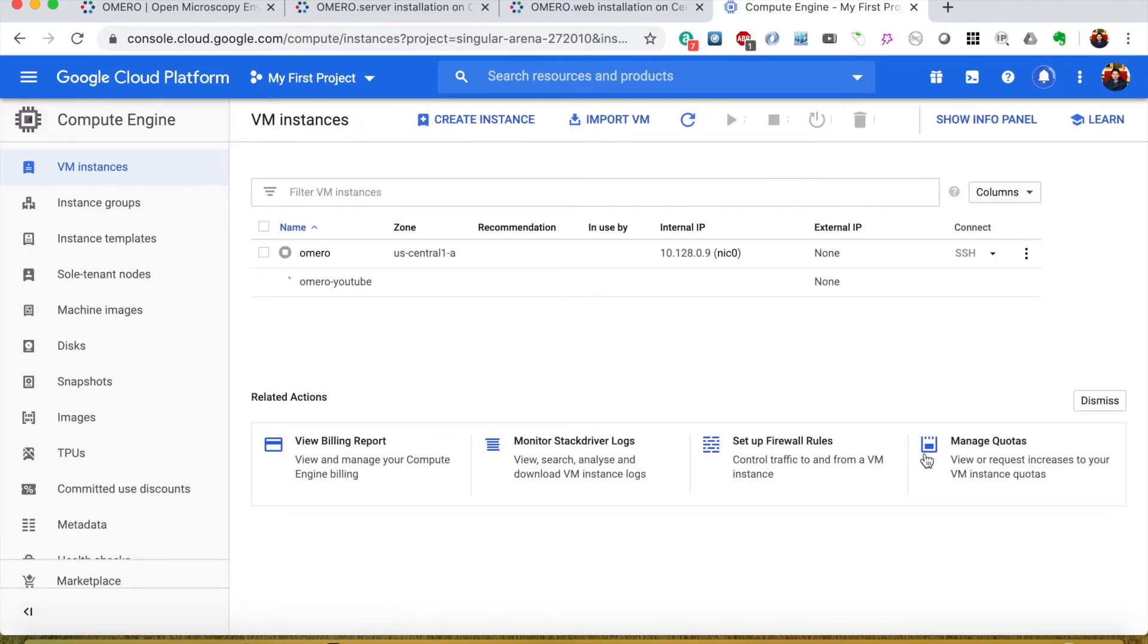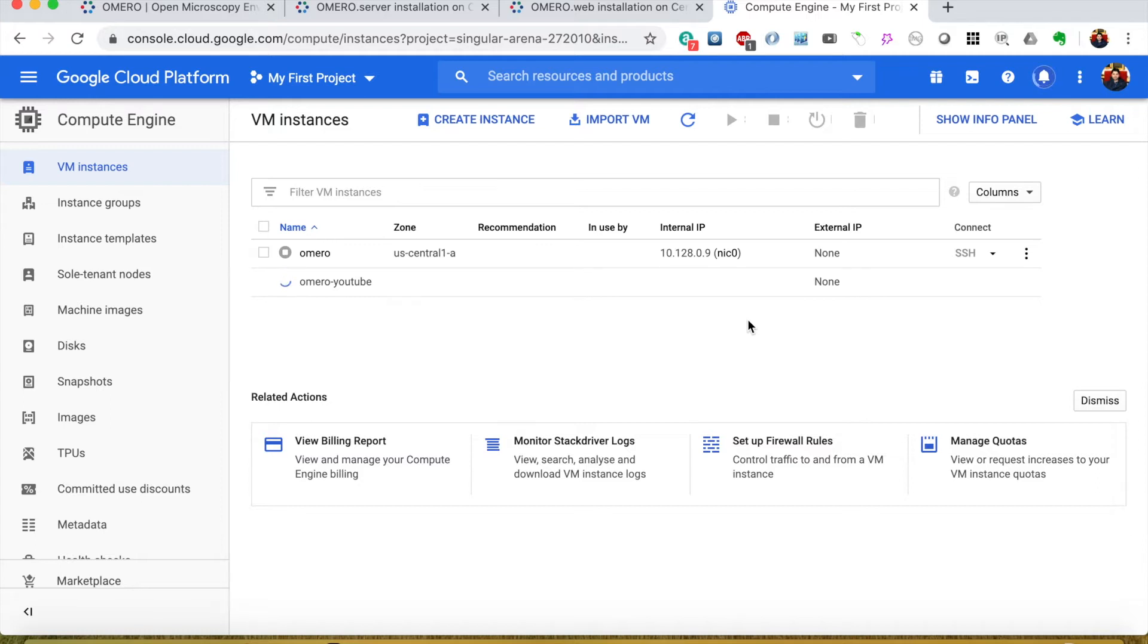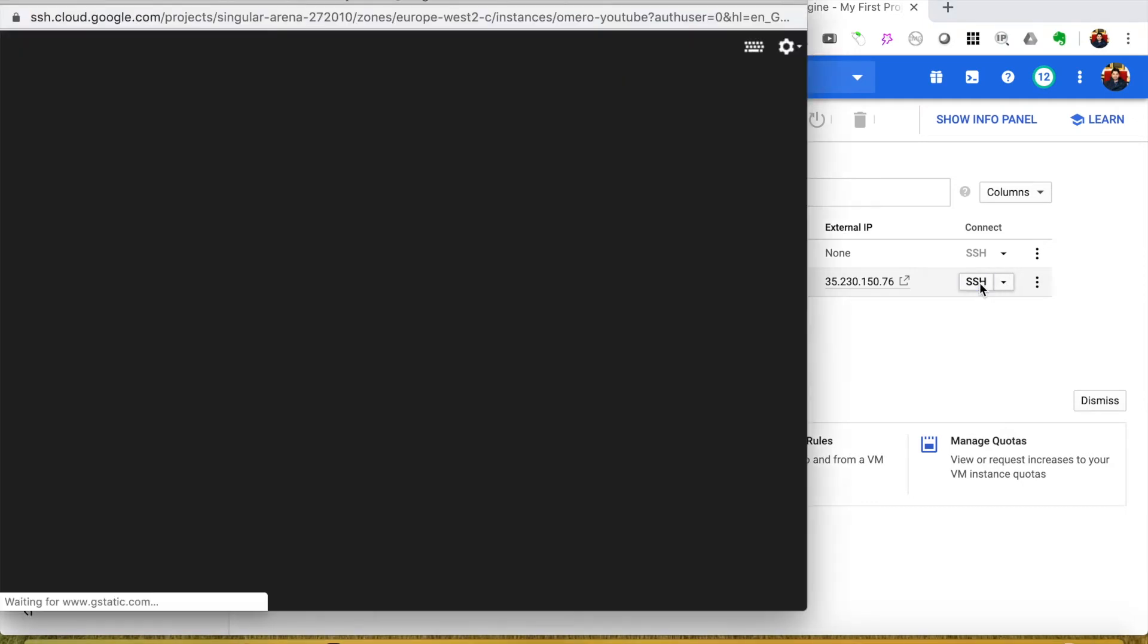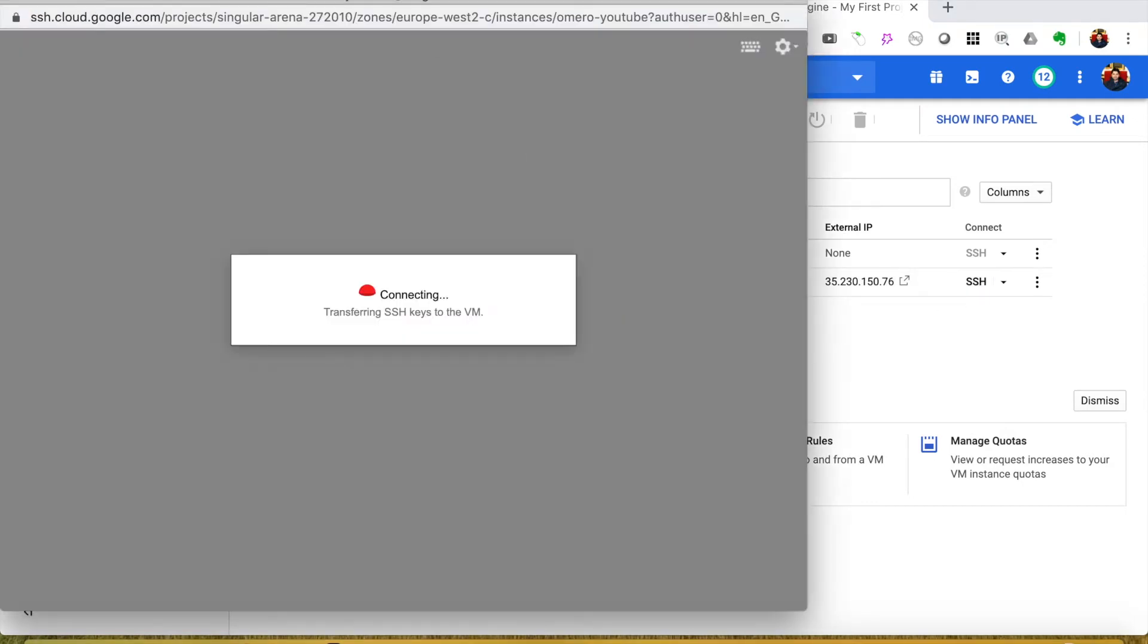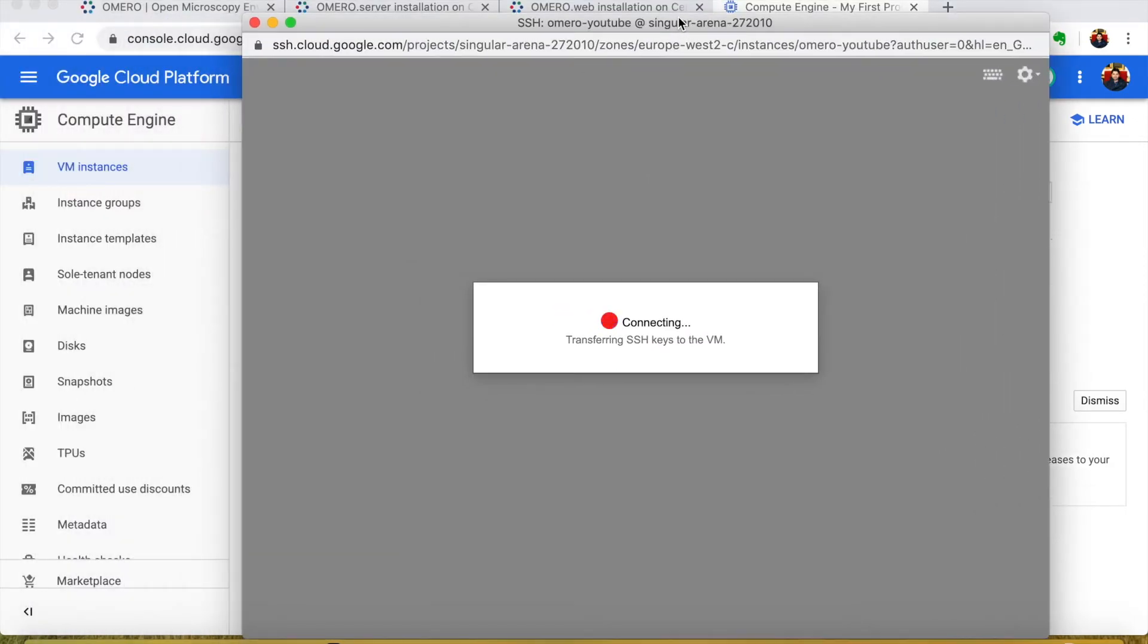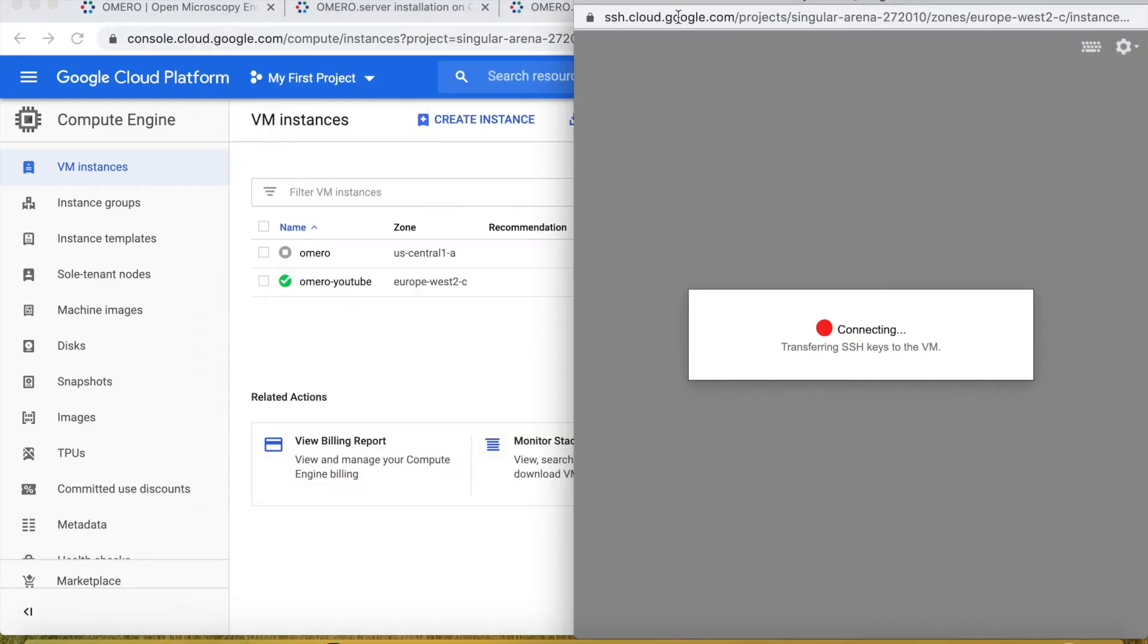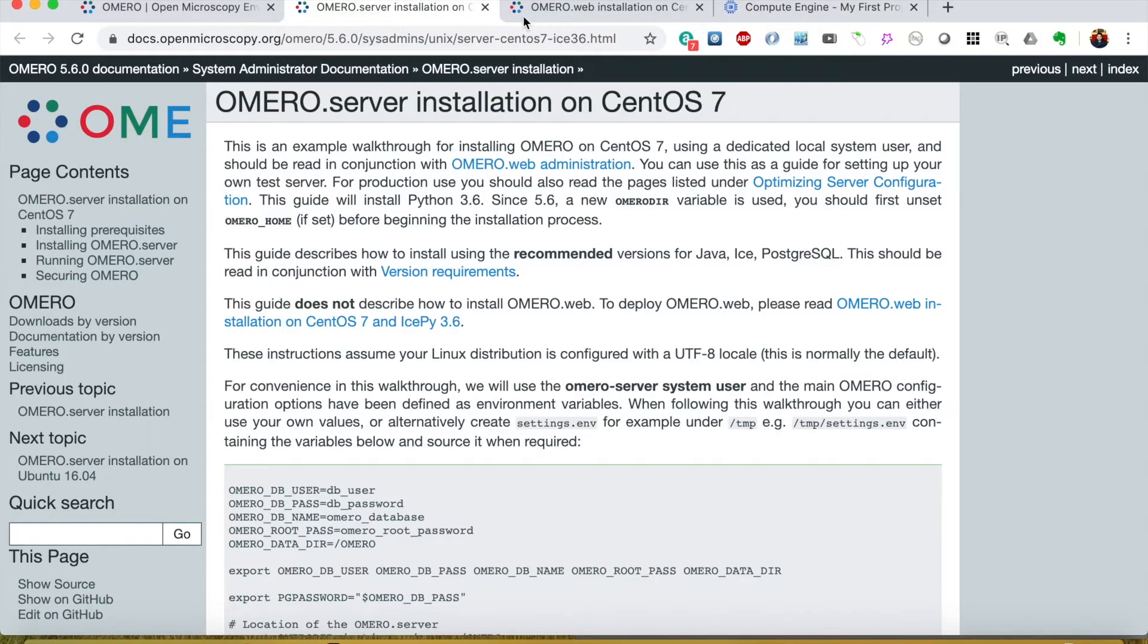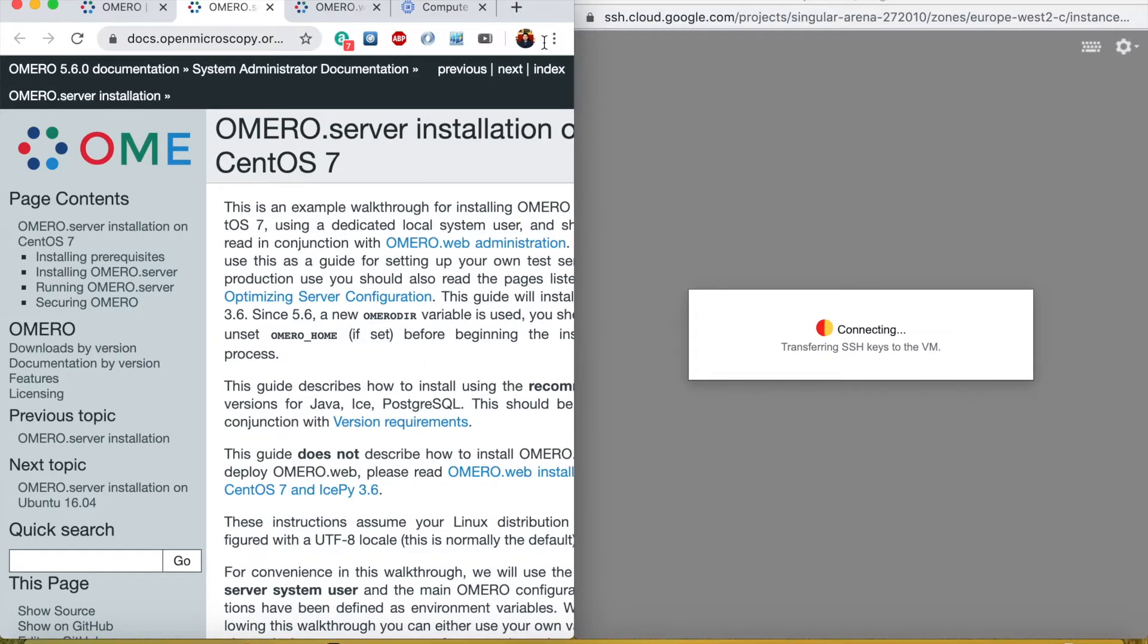It's creating OMERO YouTube and once it is done we will log into SSH. Now click the SSH and let's follow this guide.